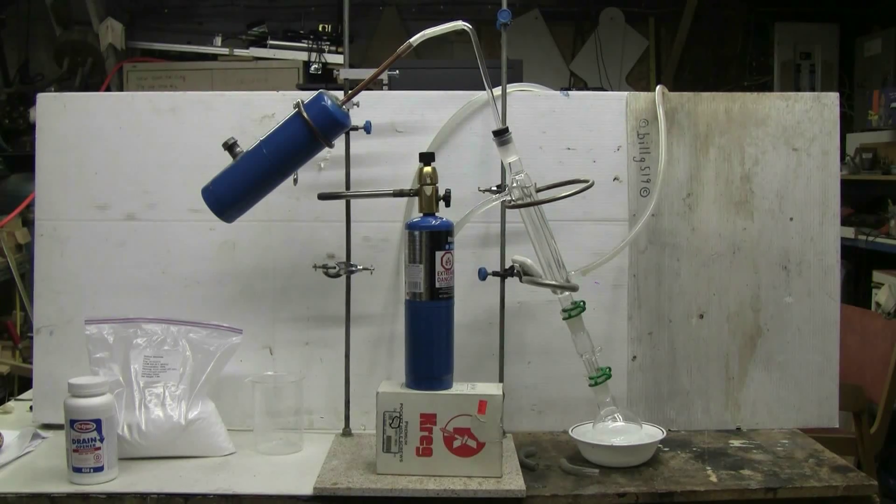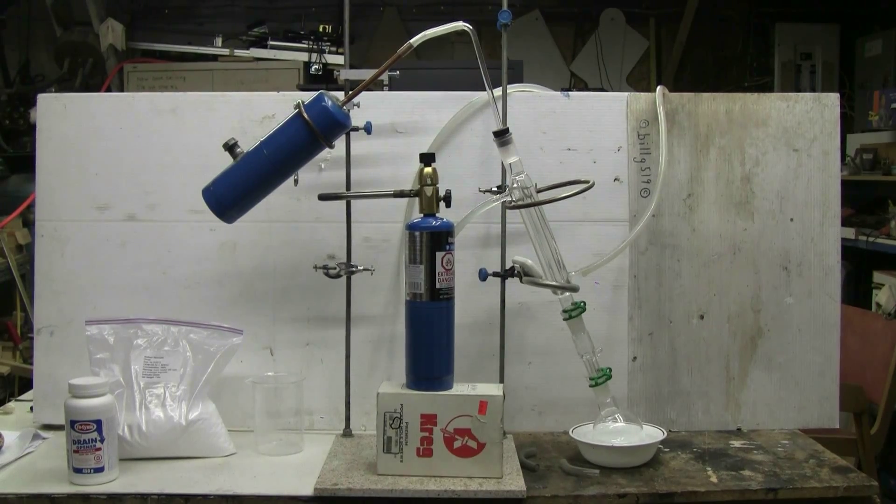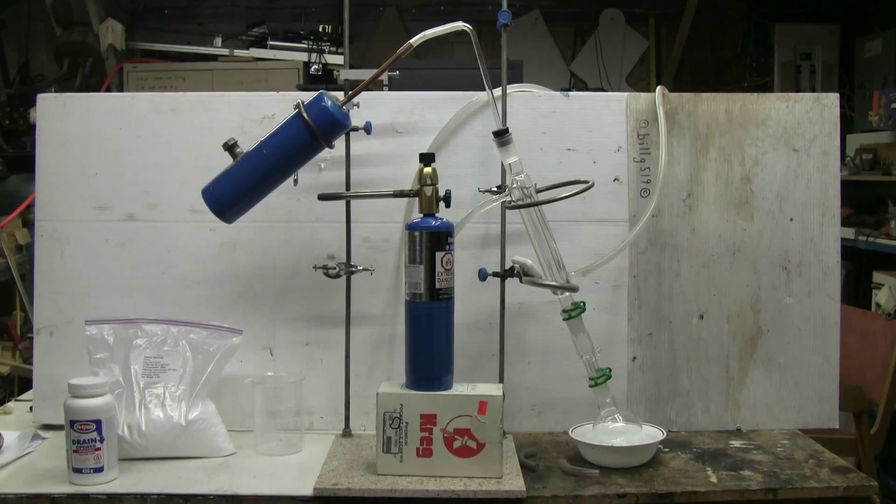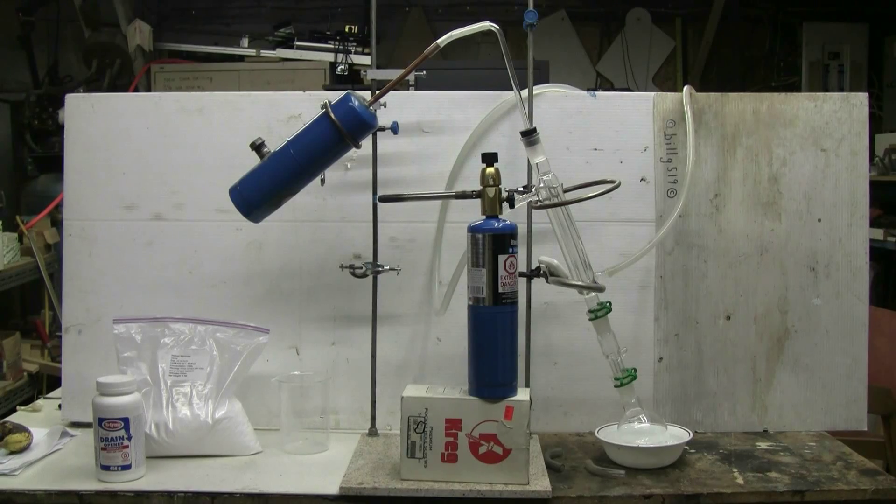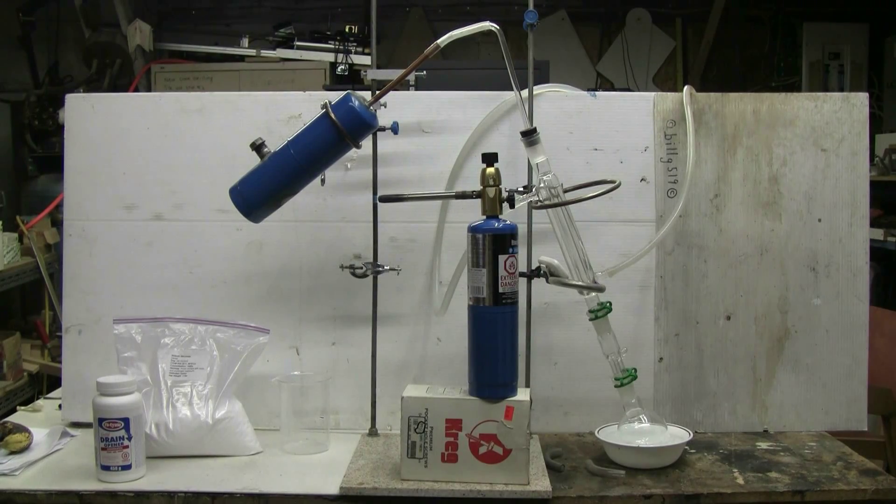Here's the final setup for this experimental synthesis of benzene from sodium benzoate and sodium hydroxide. Water flow to the condenser's turned on, the 250 milliliter round bottom collection flask is in a small ice bath. All I have to do at this point is light the torch. The torch is now lit, although it's nearly impossible to see the blue flame from the torch in the shop lighting here.